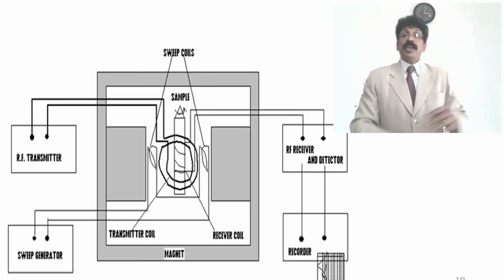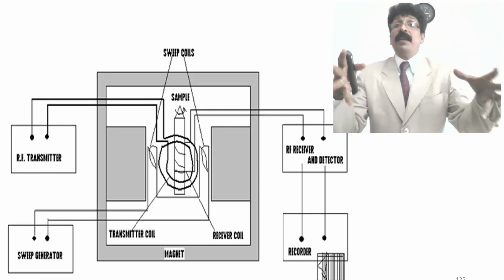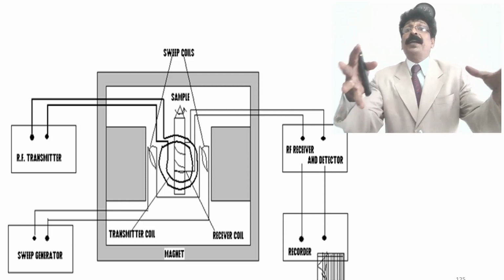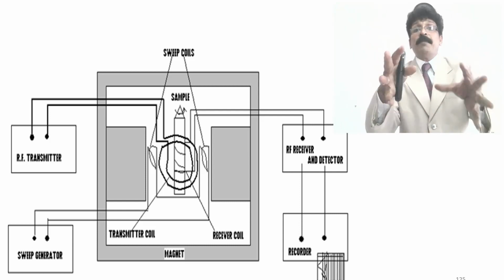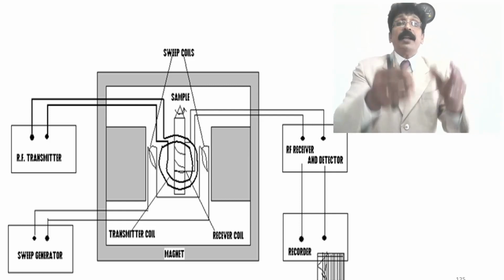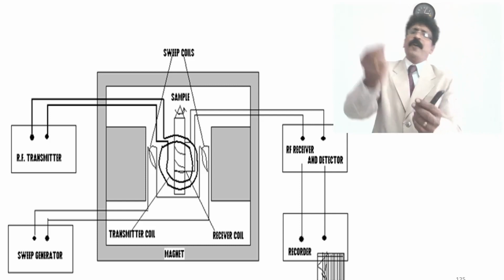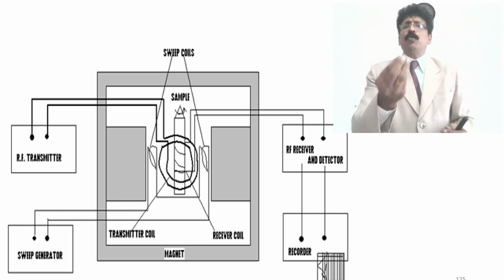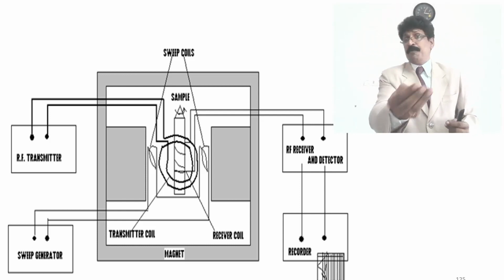See this instrument which I told you about. That will give some information for the pharmacognosy students to write about the basic principle of NMR. This is a picture drawn by me. You can see in between that the sample is kept. I have not drawn it properly. It is a sample probe where you can inject, or keep the sample as a solution. Sampling is also a big task in NMR. It's not as easy as simply keeping the sample.